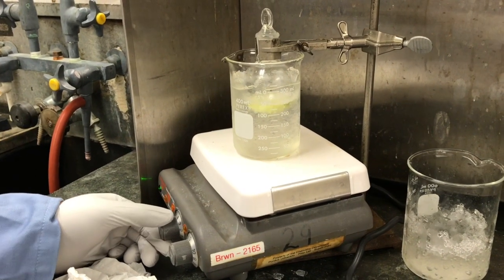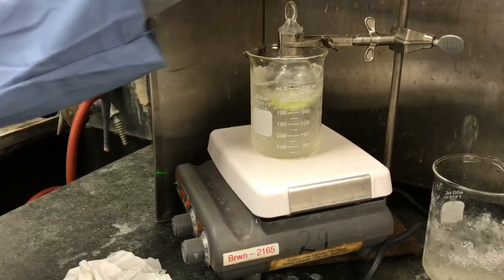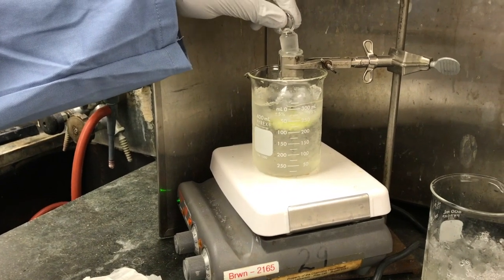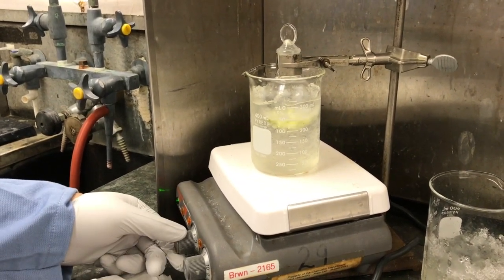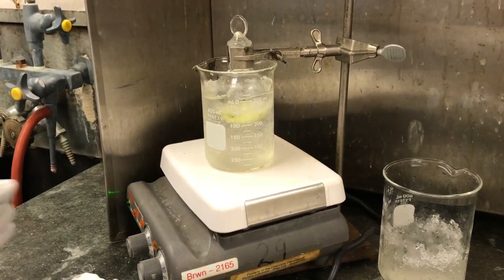So we added ethyl vanillin with sodium hydroxide. We are supposed to stir it for 5 minutes with the stopper on and dipped in an ice bath. After this stirring for 5 minutes, we are going to add our sodium borohydride.